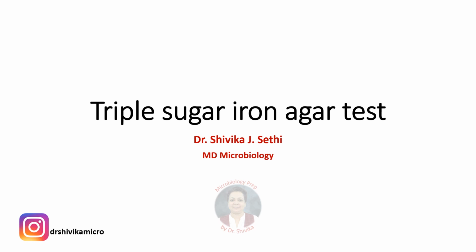Today I'm going to talk about the triple sugar iron test. This is a test that confuses many students studying the biochemical reactions in microbiology. By the end of the video, hopefully all your doubts with regards to the principle and the interpretation of the test results will be clear.